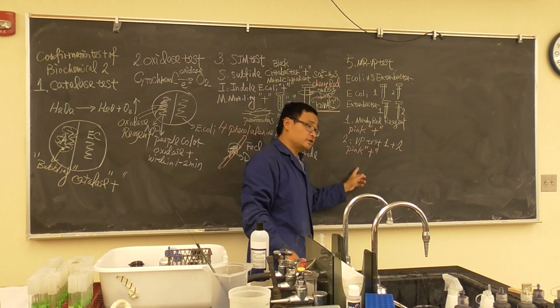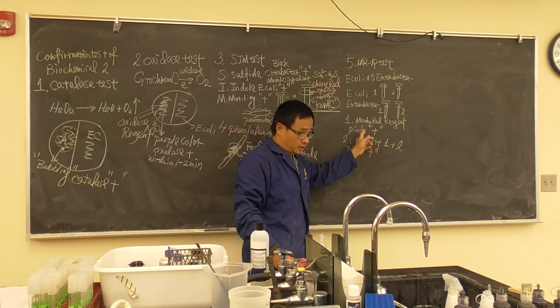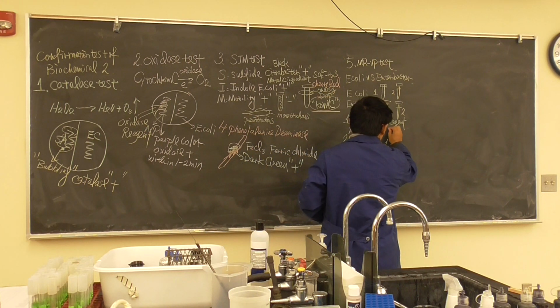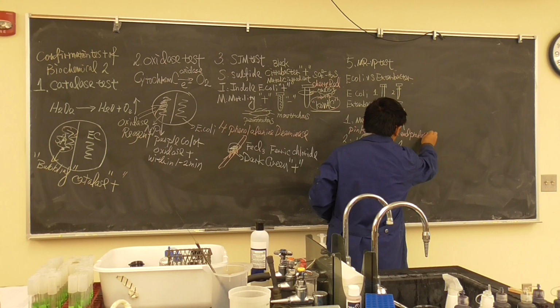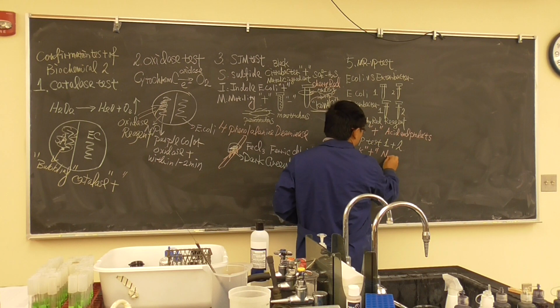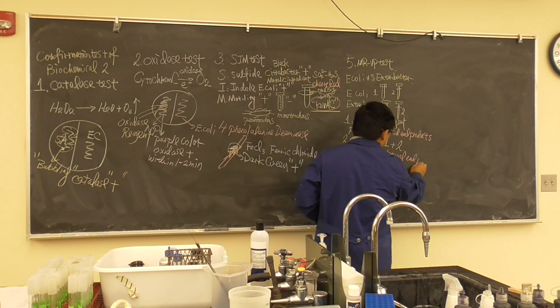Now, what we are testing for? Methyl red reagent we are testing during the fermentation, they generate acid end products. And the VP test we are testing neutral end products after fermentation.